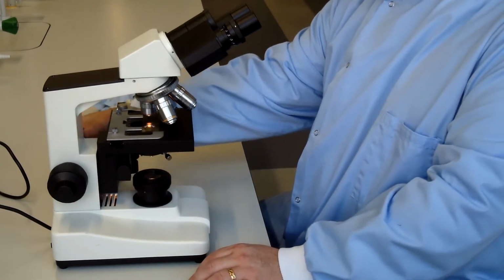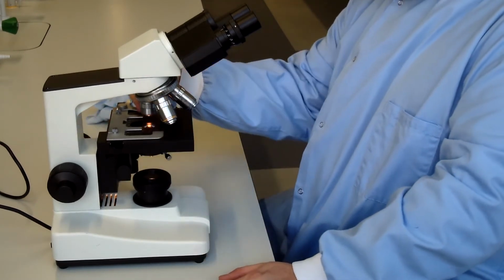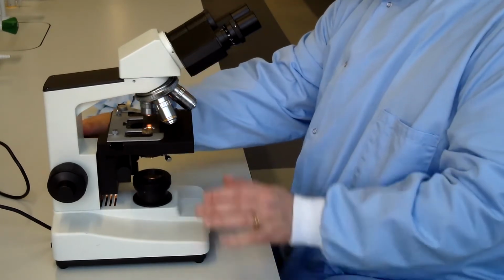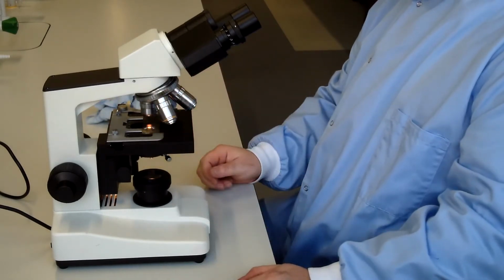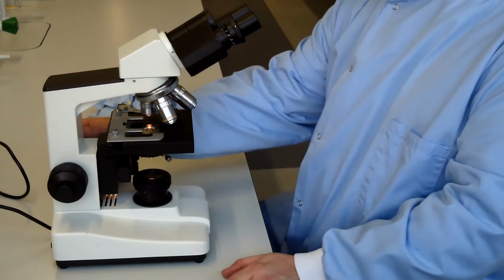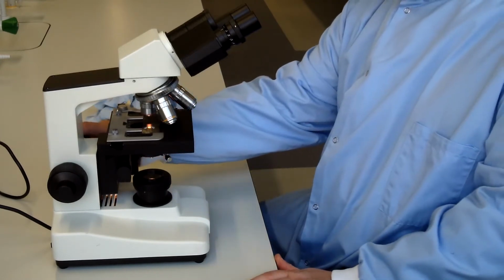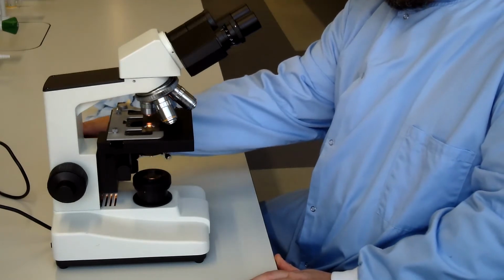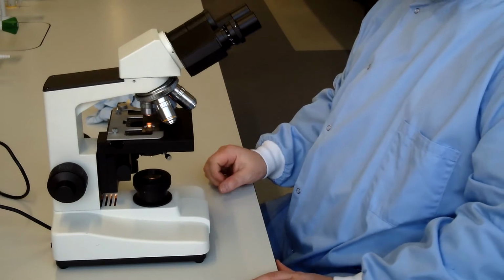The next thing to do is to focus the microscope. So at ×4 the stage can be brought up to its highest level without damaging the objective, which is not true for some of the other objectives, where if you bring the stage too high you'll damage the lens. For ×4 we start at the highest level of the stage and then focus away from the objective.